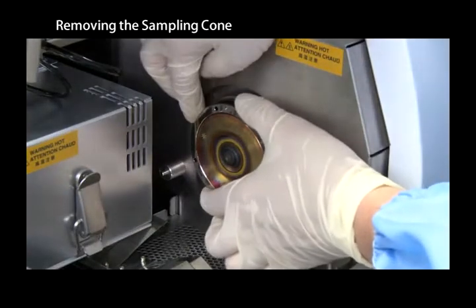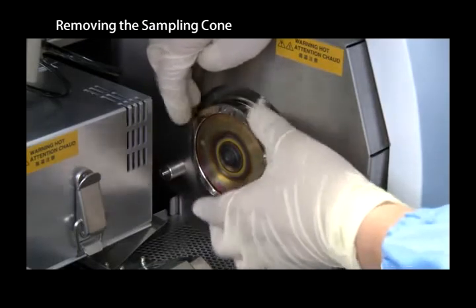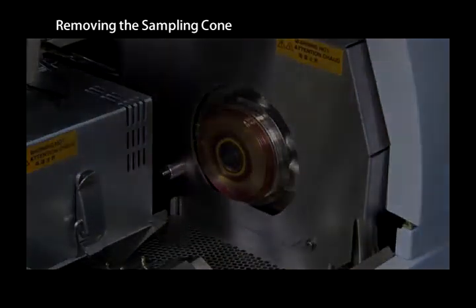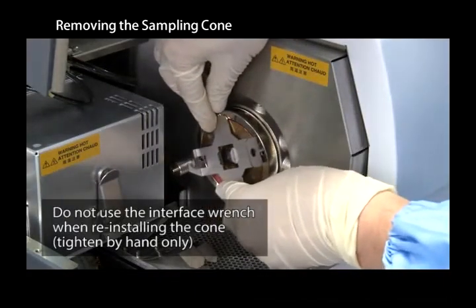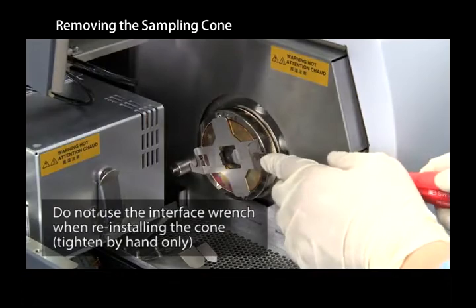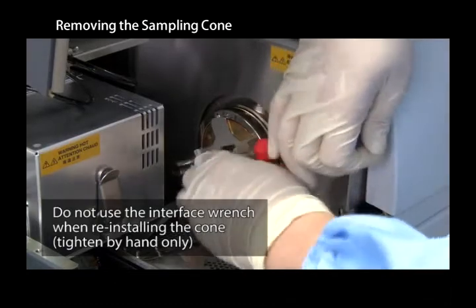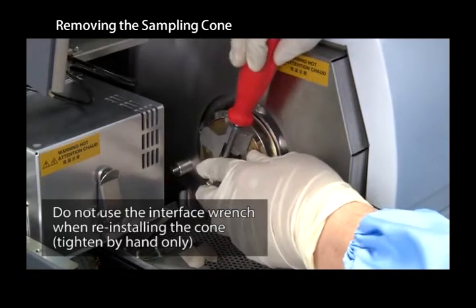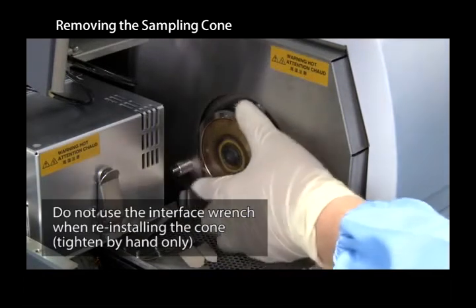Manually turn the retaining ring counterclockwise and remove it. Use the interface wrench if the retaining ring will not loosen. Run a screwdriver through the holes on the sides of the wrench and apply force to loosen the ring. After loosening the retaining ring, remove it by hand.